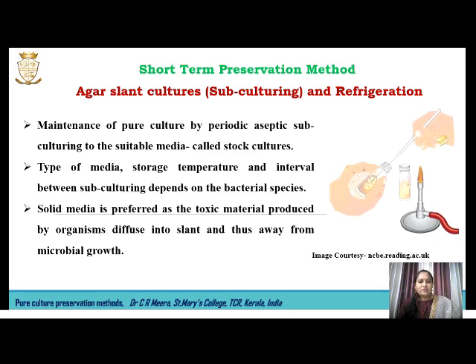The selection of media, the storage temperature, and the interval between subculturing will depend upon the type of organism we are cultivating.